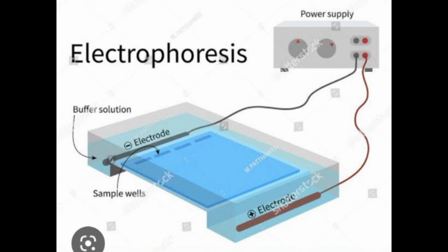An electric field is applied across the gel, causing the negatively charged proteins to migrate across the gel towards the positive electrode. Depending on their size, each protein will move differently through the gel matrix. Short proteins will easily fit through the pores in the gel, while the larger ones will have more difficulty. After a set amount of time, the proteins will have differentially migrated based on their sizes. Smaller proteins will have traveled further down the gel, while larger ones will have remained closer to the point of origin. The proteins may therefore be separated roughly according to size. However, certain glycoproteins behave anomalously on SDS gels.